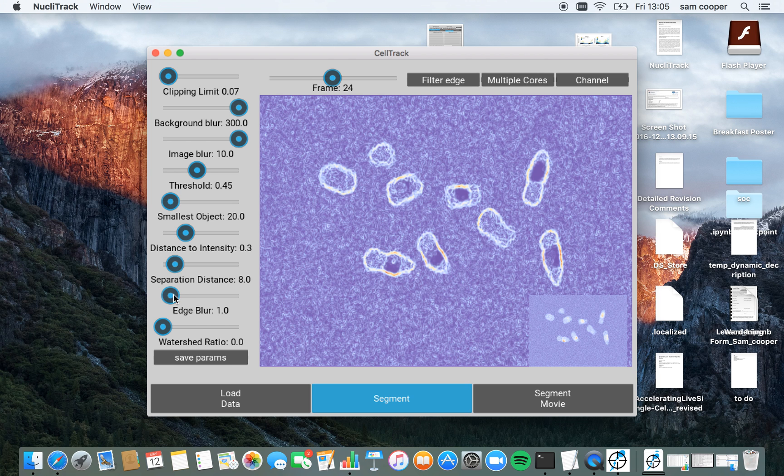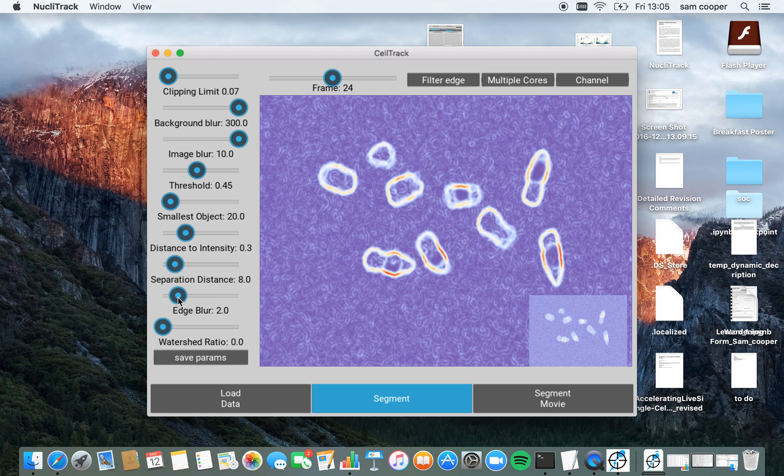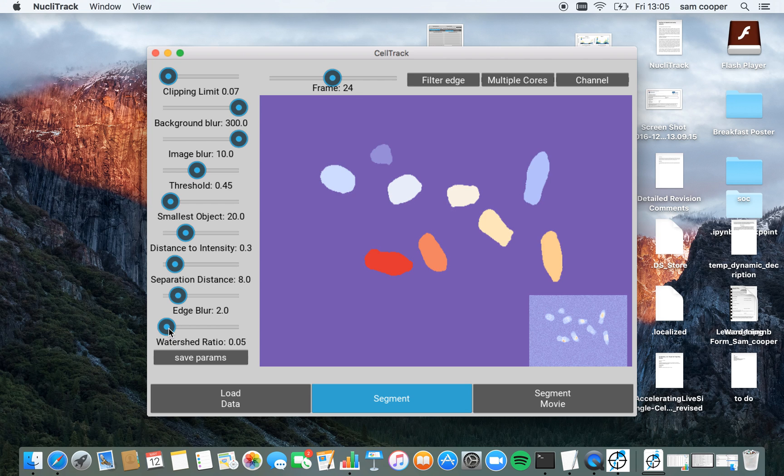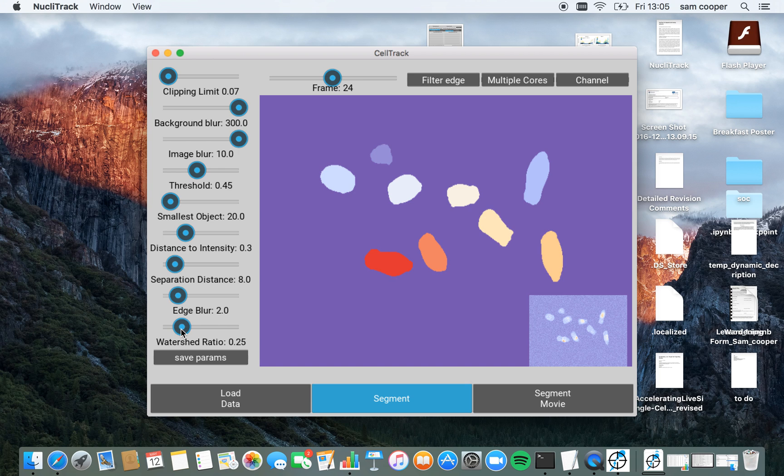Finally, edge blur identifies the edge of the nuclei. And this is necessary for the watershed algorithm we're about to perform. Finally, this watershed ratio determines to what degree the watershed pushes out from the center.